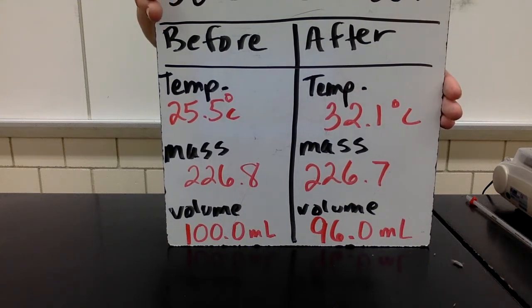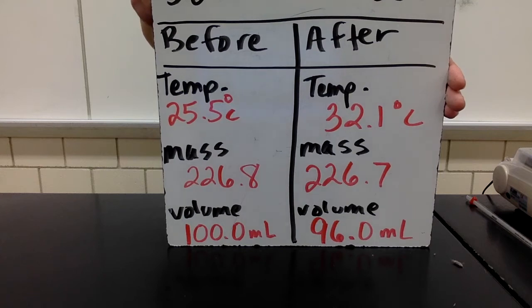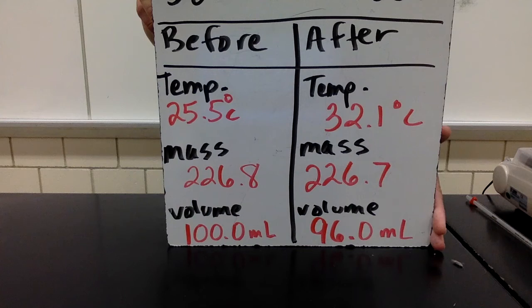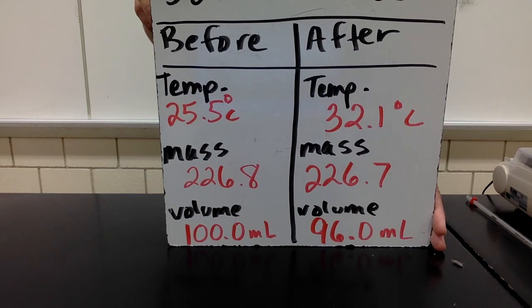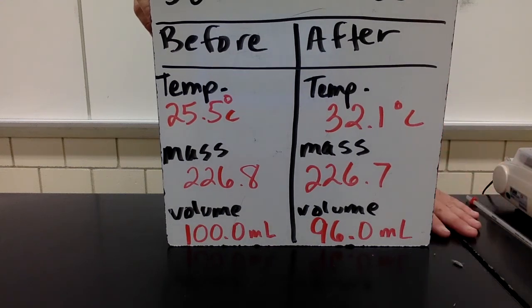So then, after I stirred them together for about 2 minutes, I took the temperature again, and it had gone up to 32.1 degrees Celsius. I put the whole thing on the balance again and found that the mass was pretty much the same, a difference of about 0.1 of a gram. So the mass after was 226.7, but the volume had gone down significantly. It started at 100 and went down to 96, so it's about a 4% drop in the volume. That's significant. The drop in mass is a very small percentage of the mass, almost non-existent.